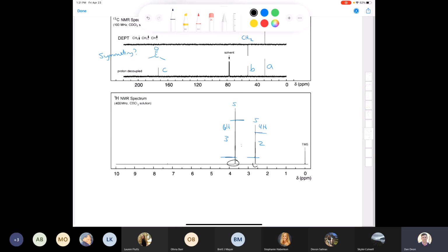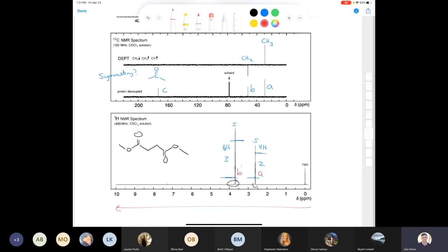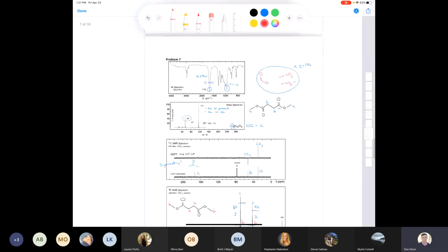Let's do the same thing for our proton NMR spectrum. Redraw the compound. Ink is cheap. Paper is cheap. Like this. We have 2 kinds of protons. We'll call these the A protons and the B protons. Again, we're annotating going from right to left. It has to be done in that manner or it's not correct. You cannot receive full points unless the spectrum is annotated properly. We have A for our methylene protons, and we have B for our methyl protons, like that. And there you have it, dimethylsuccinate.